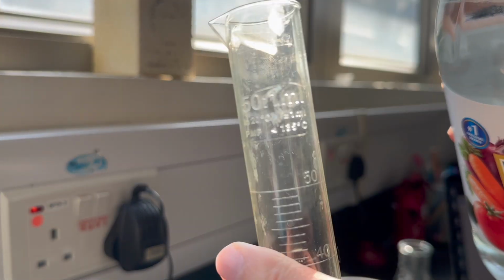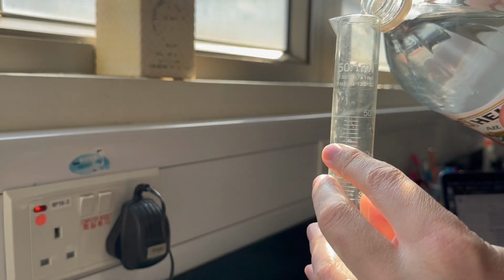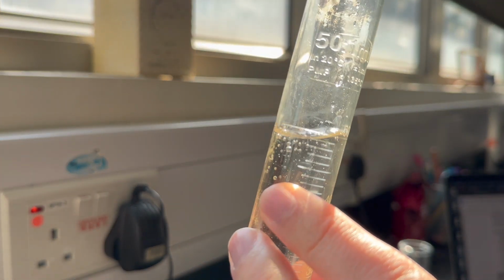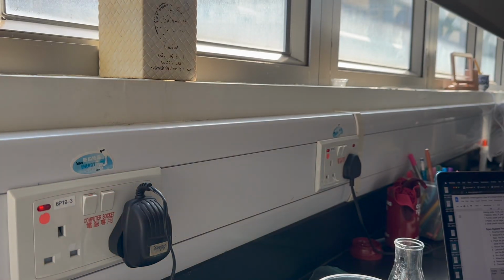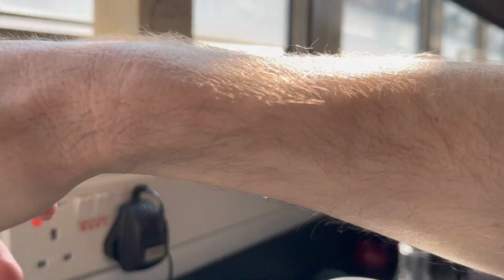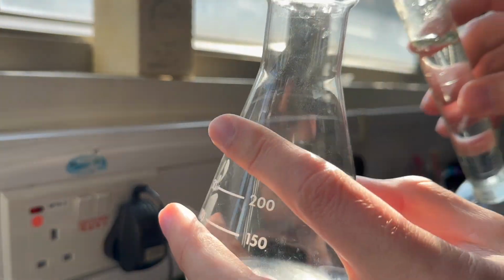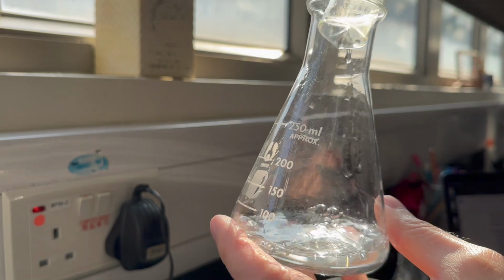And I'm going to fill it to the 50 milliliter mark. And there we go, 50 milliliter mark. Put the lid on. And I'm going to put it in the flask. So here's the vinegar going into the flask.